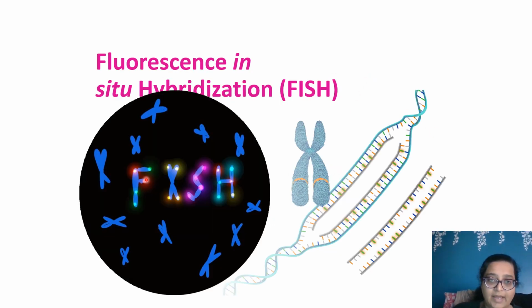So these lighted points, this orange, yellow, red signal, green signal, is how FISH appears on a dark blue background, and this bluish color is DAPI. This is how the unstained cells which do not have that mutation will appear under a microscope.